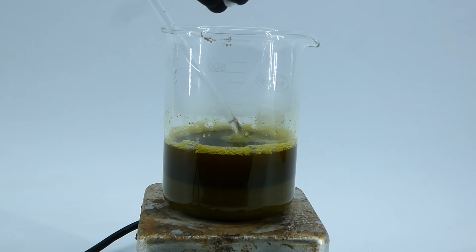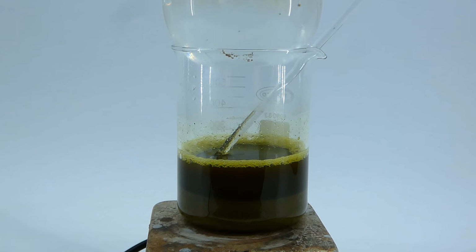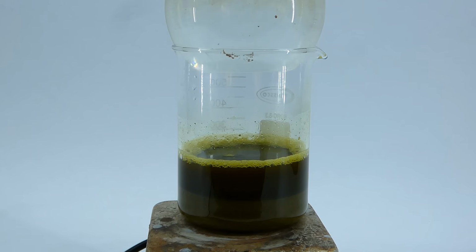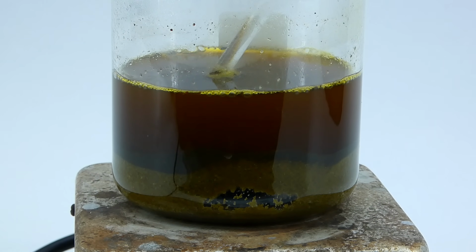I tried to stir it with my new big stirring rod, but it was still too small, so it just sat there. To speed up the reaction, I turned on the heating and put a flask with cold water on top of the beaker to condense any acid vapors, creating an improvised reflux. What is going on here is that the acid dissolves everything organic and mineral, while leaving behind just the sand.